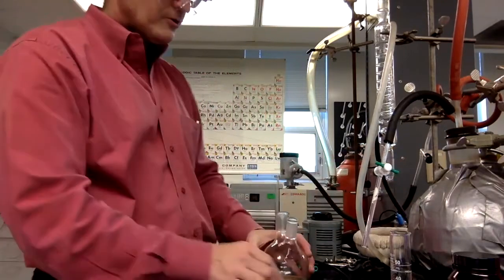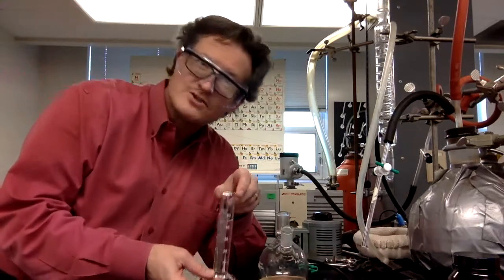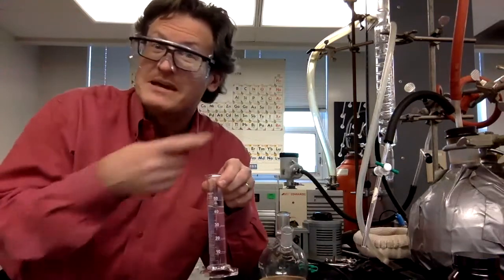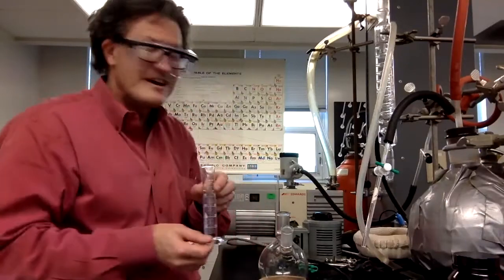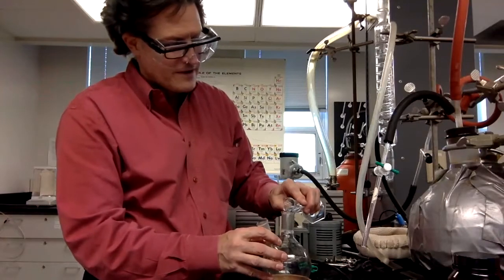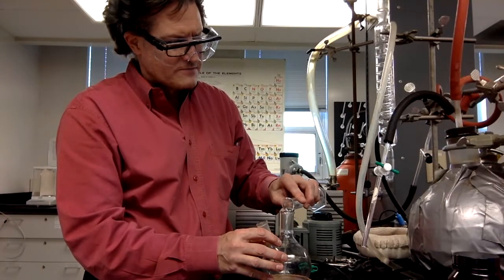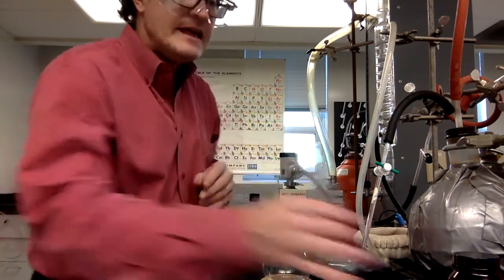All right, so what are we gonna do? If you look in the procedure, it tells us to put about 50 mLs of our liquid. Oh, okay, so I've got 50 mLs. This is the cooking show part where my assistant, i.e. me, before I started filming this, has already filled up 50 mLs of ethanol, and we can pour that into our flask. And it doesn't have to be exact, so I've just poured it in there roughly. Boom. All right, we get that in there, good. And then we want to provide nucleation sites, right, for the boiling, make the boiling easier.